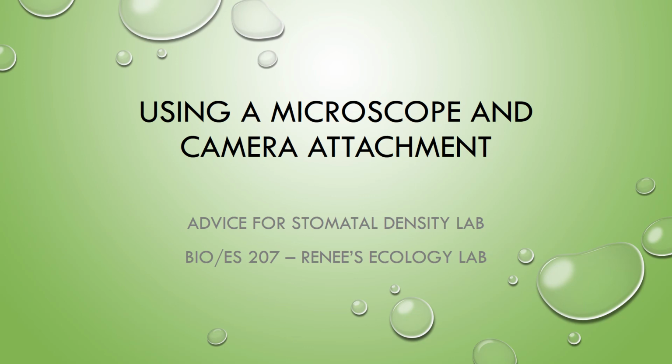Welcome to this tutorial on using a microscope and a camera attachment. These are pieces of equipment that you're going to need to be able to use in order to be successful in the stomatal density lab, which is a two-part lab. We have a set experiment where we're going to be looking at slides, and then you're going to design your own independent research questions. So pay attention.